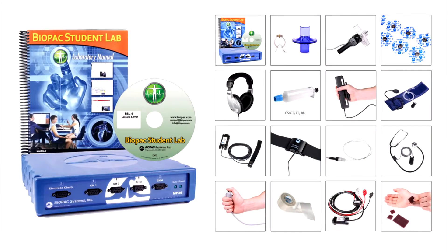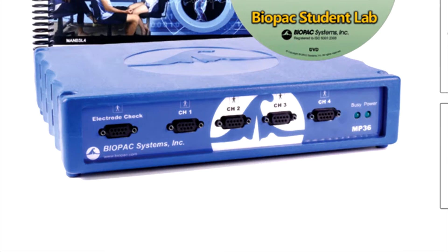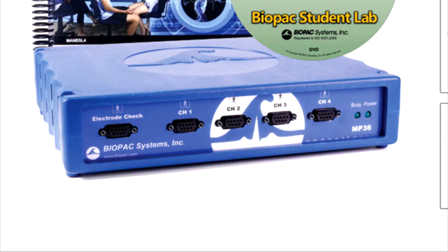This BSL system includes the following. The MP36 Data Acquisition Unit. This is the heart of the Biopac Student Lab System.